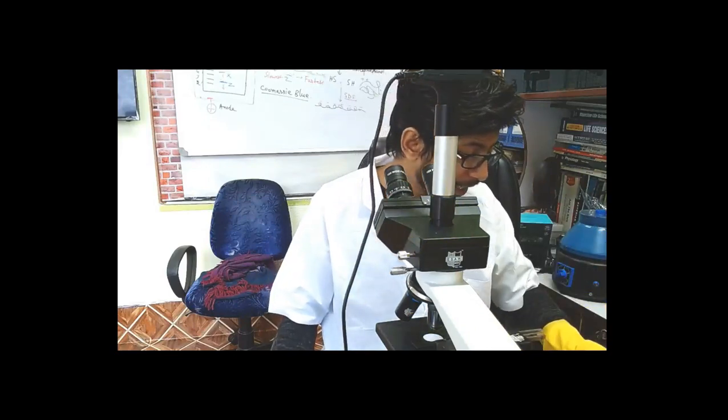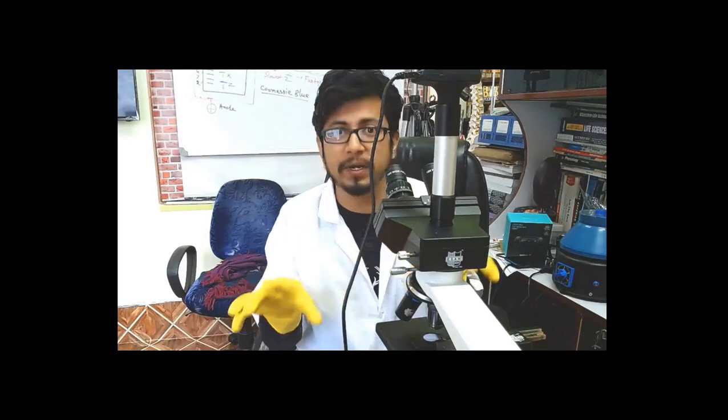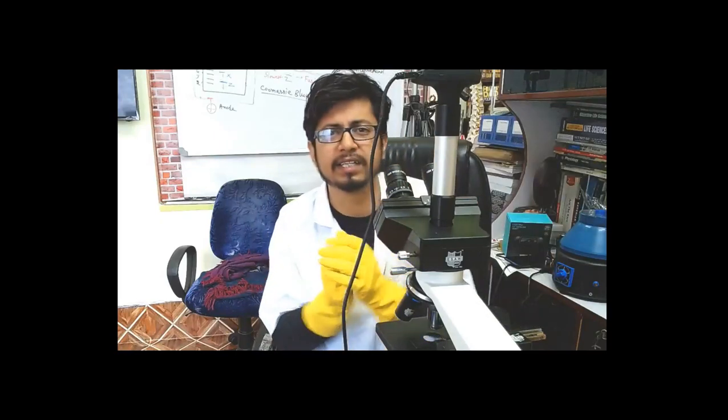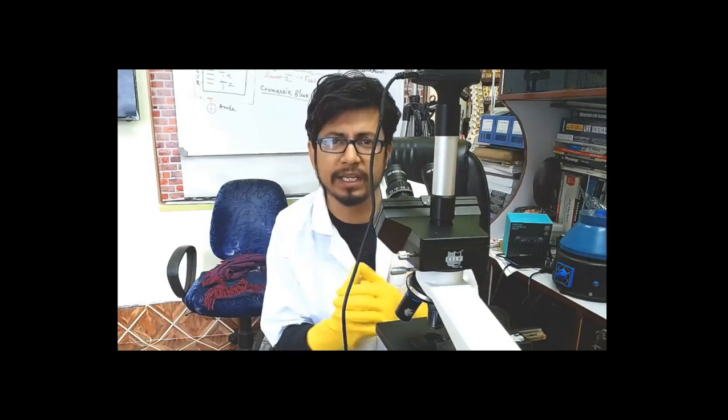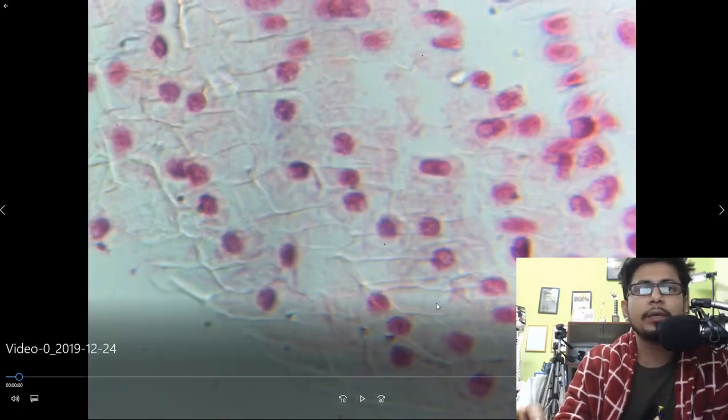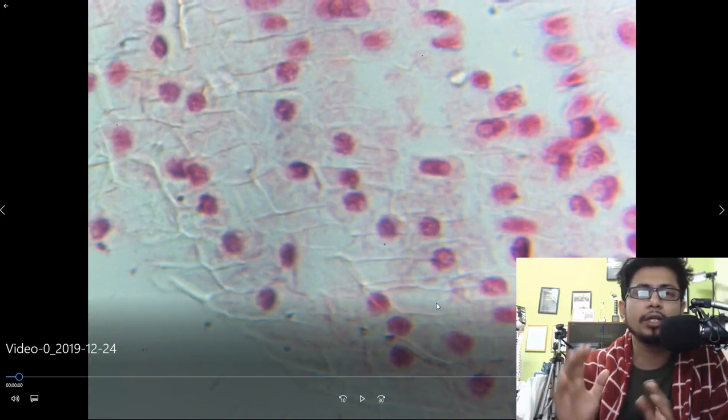After staining, we are going to put it on a slide and crush the root — hopefully it spreads well because we heated it up well. Generally the stain takes a long time to absorb, so we are staining for a long time here.